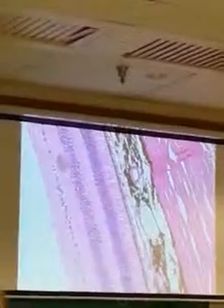So ganglion, bipolar, rods and cones, pigmented layer, choroid, sclera, just alternating colors. It's like tiramisu.